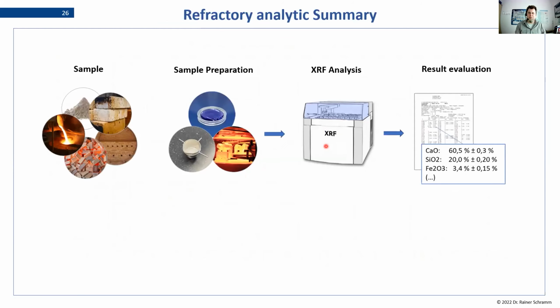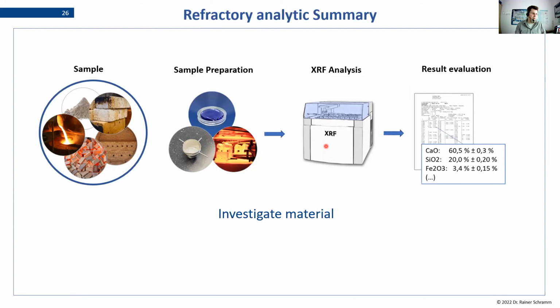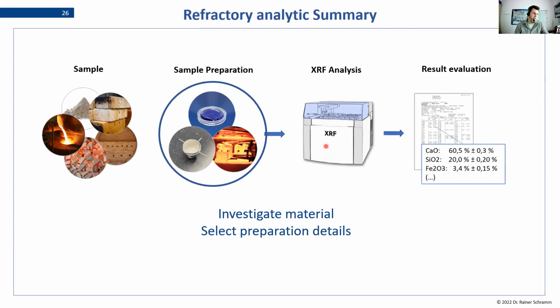And yeah, as the summary, just to round up, we talked about our samples. So when you want to do a refractory analysis, the first question is, what is your material group? Or is it even a group, or is it different materials? What other refractories you want to analyze? And then you can group certain ones which are similar. Some are not. Sometimes you have to split them to get the high accuracy that you want to achieve.